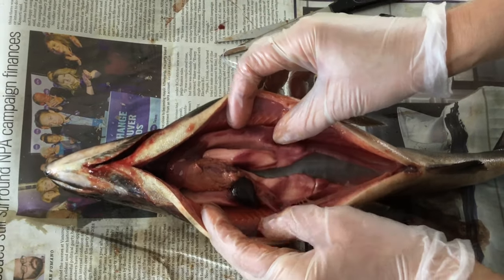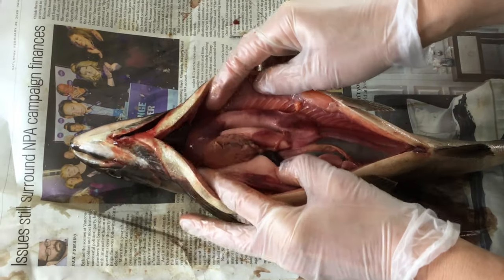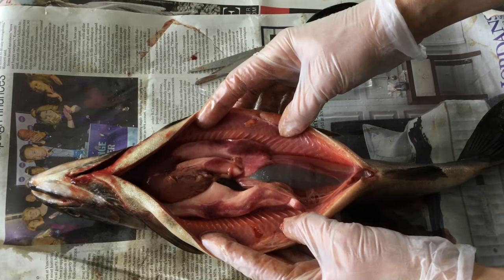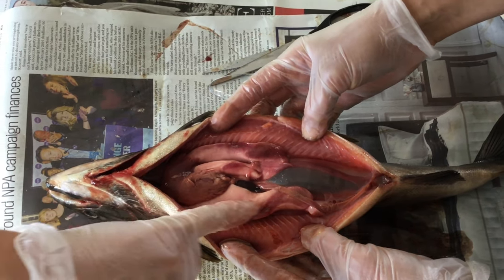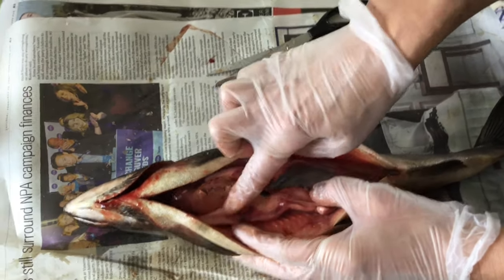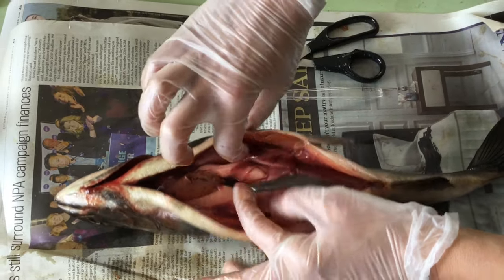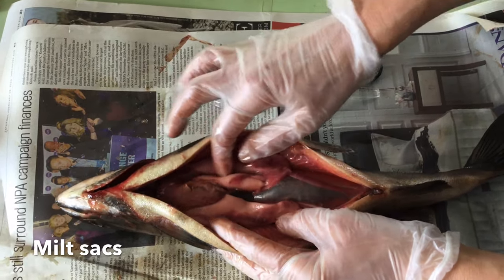We have a boy. We have a male. We were hoping it would be a female, because the female would have eggs. But instead, we have a male. So, if our fish were a female, there would have been two sacs of eggs joined to the fish near the head. However, our fish is male. We are going to find two quite huge sacs, or testes, that make milt when the male is ready to spawn. Miss Anima is going to pull those out.